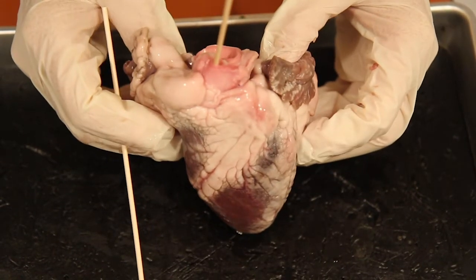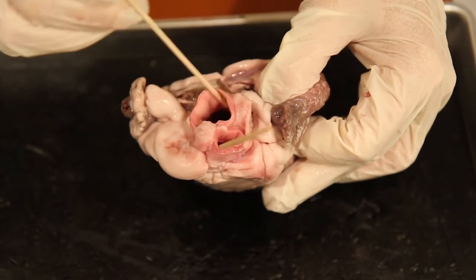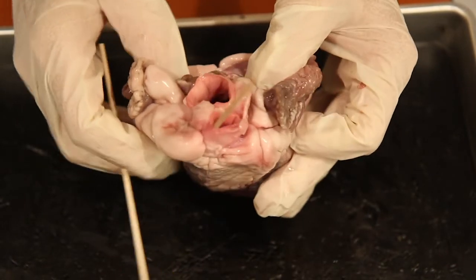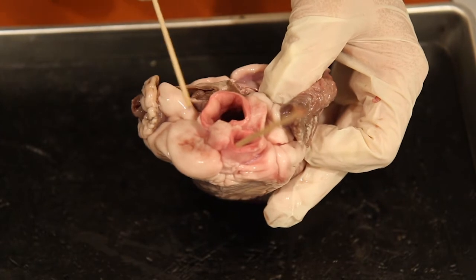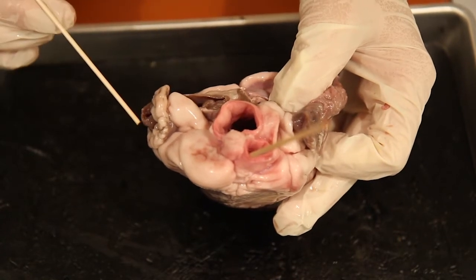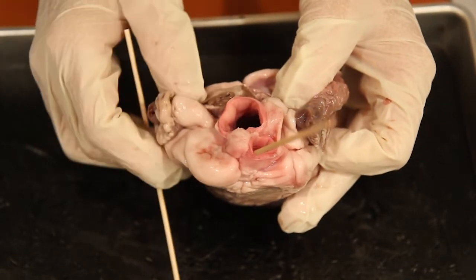On five, after locating the pulmonary trunk, locate the aorta — the very large, huge vessel posterior to the pulmonary trunk. Often, if the aorta has not been cut too low, you can see another vessel called the brachiocephalic, which is a branch off the aorta. On this heart it was cut too low, so you won't be able to see the brachiocephalic artery.